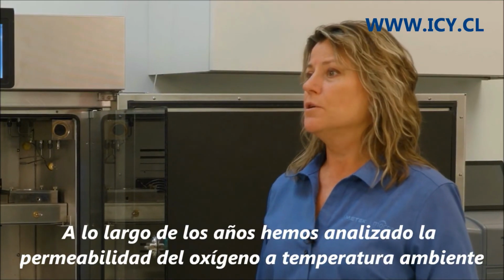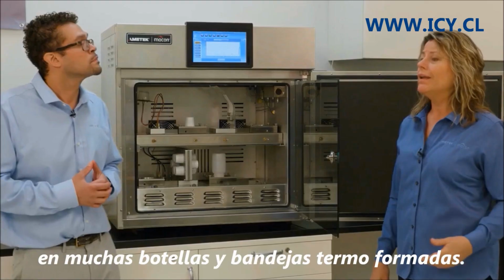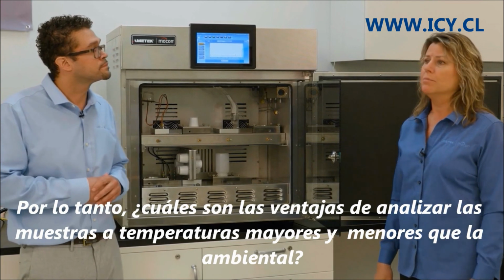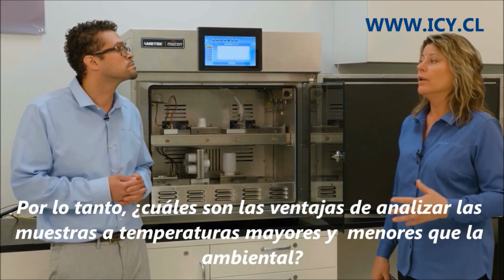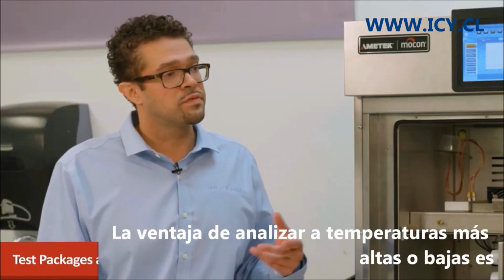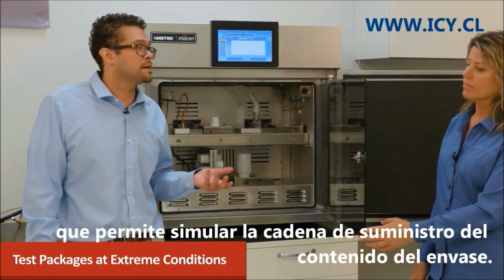Over the years, we've tested many bottles and thermoform trays for oxygen transmission rate at ambient temperature, right? Ambient lab temperatures and conditions. So what is the advantage of testing samples at higher and lower temperatures? The advantage of testing at higher or lower temperatures is because you can actually simulate your supply chain.